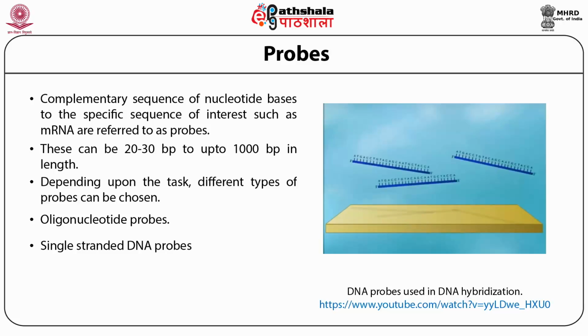For preparing the probe from PCR amplified product, the product of the first round of amplification is used as a template in a subsequent round for generating an extended fragment. But using only a single antisense primer this time, thus single-stranded DNA would be produced. Third, double-stranded DNA probes. If the sequence is known, then appropriate primers can be used to amplify the desired fragment, and a relatively clean preparation of a double-stranded DNA can be obtained.